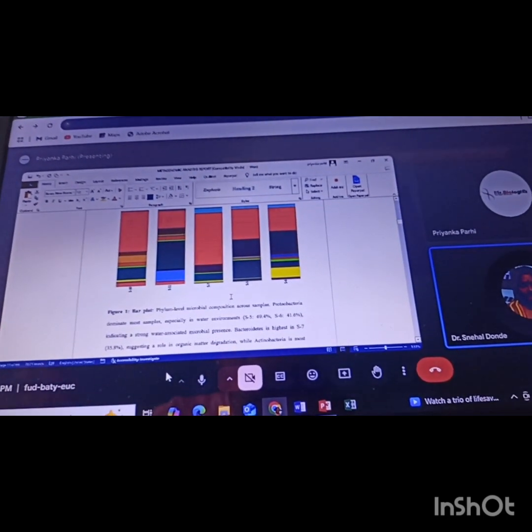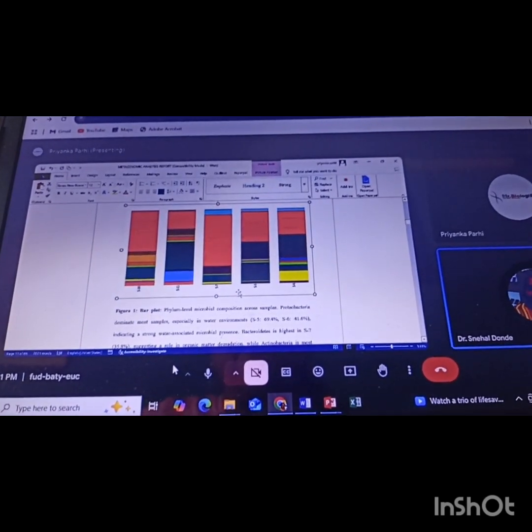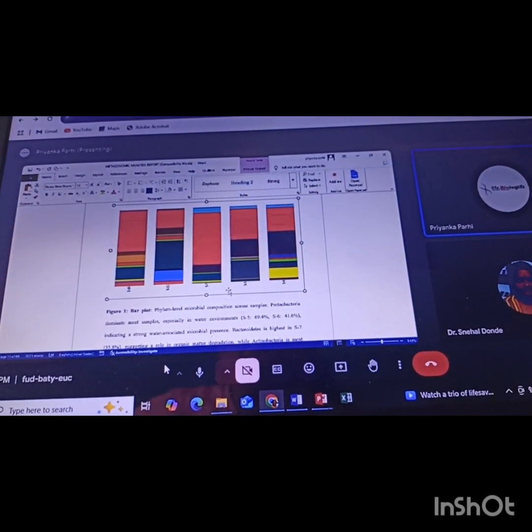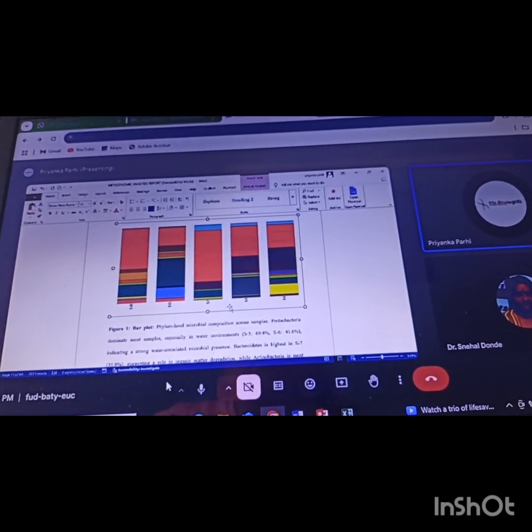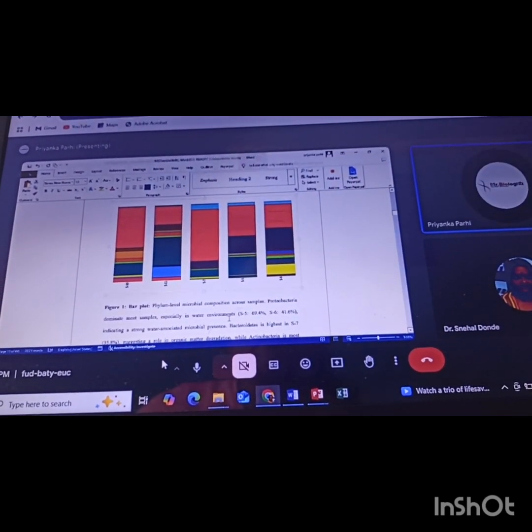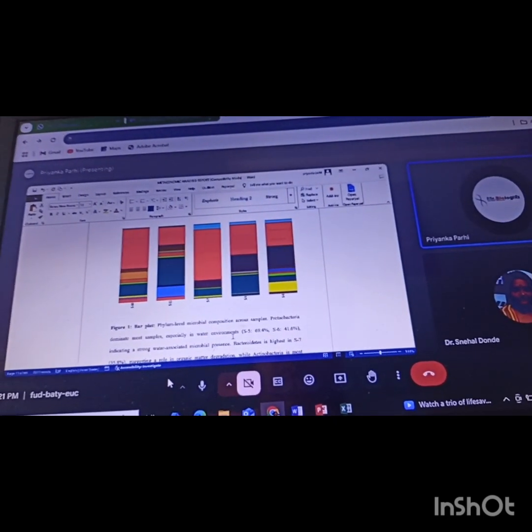How do the colors signify? I was wondering why it is green, why it is red. There are thousands of phyla, and we are provided a gradient, so we select which gradient we want. Individually identifying each color is difficult. That's why we give the percentage, for example how much percentage is proteobacteria. These colors can change, it's not something fixed. It's a gradient provided by the software.